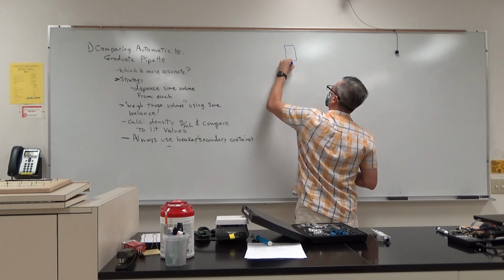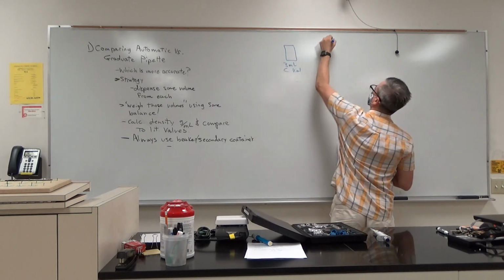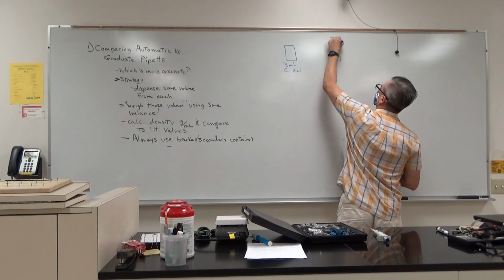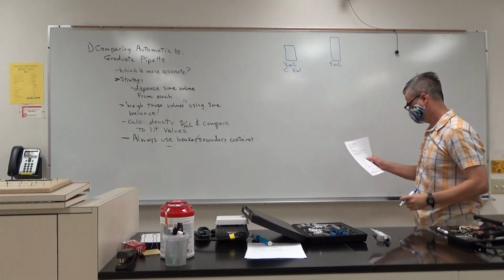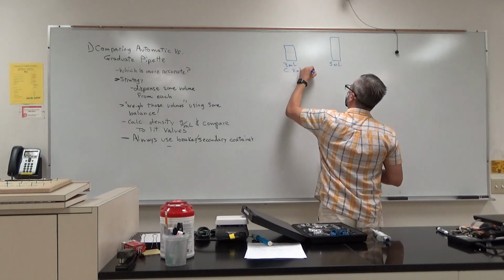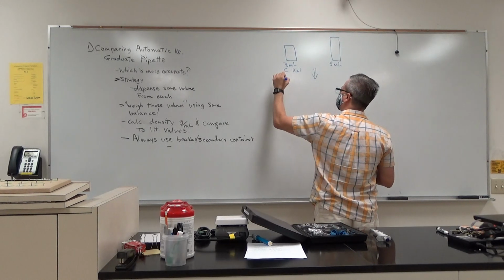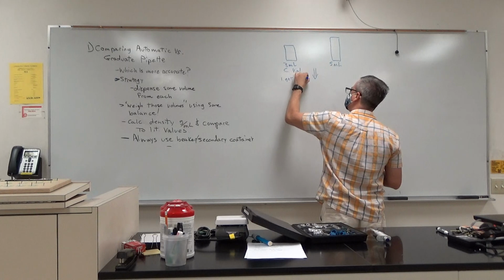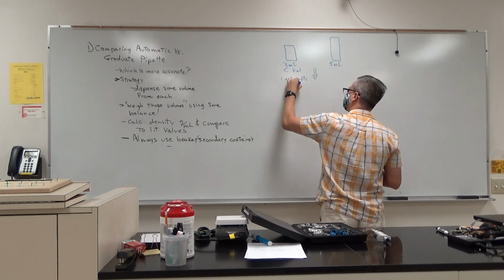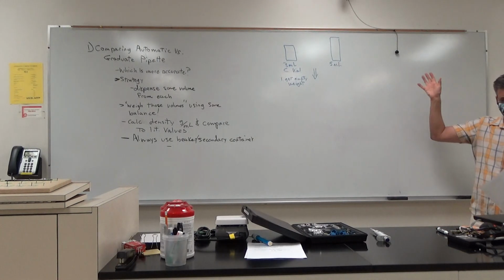I would take each of those, and step 1, get the empty weight and write it down for each of those.